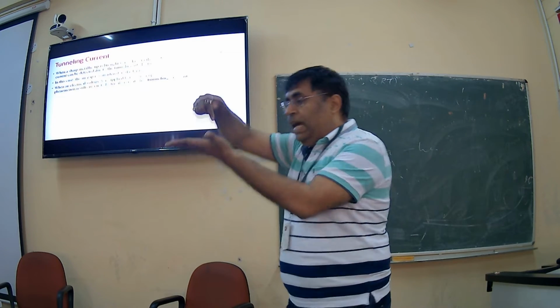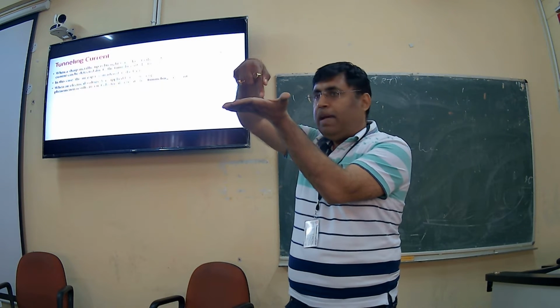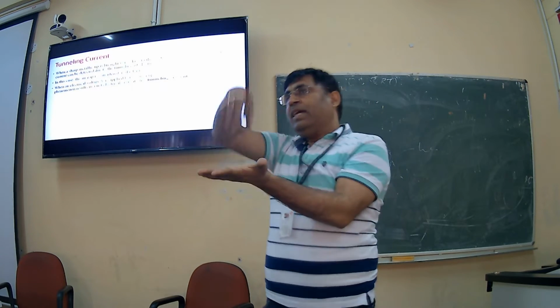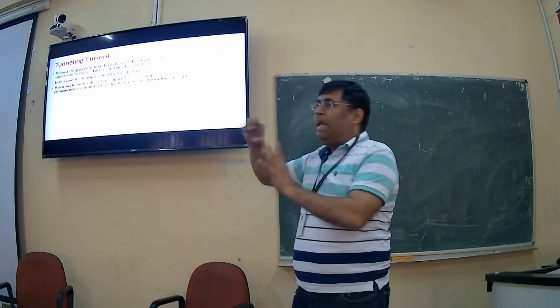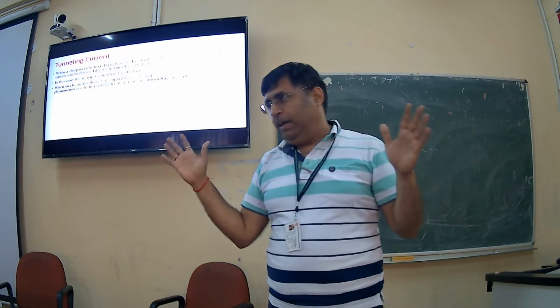So here although tip is very close but it is not completing the circuit. हाँ, सर्किट नहीं कंप्लीट हो रहा, but in quantum, because of quantum mechanics, quantum phenomena, electron can tunnel and circuit can complete it, and then you will see an electric current, and that will be displayed on your computer, and you will see the image. Got this point? This is the tunneling current.